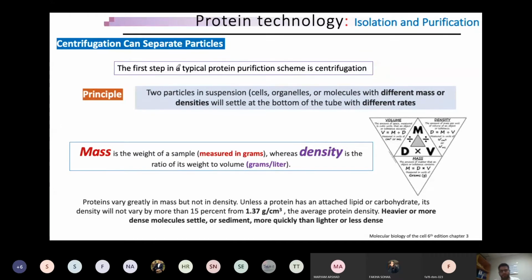You start from any material and you will do it the same. It's not a rule. ऐसा नहीं है कि ये कोई कानून है, but it's just the most suitable thing we do. So we start with centrifugation so that we can separate things.